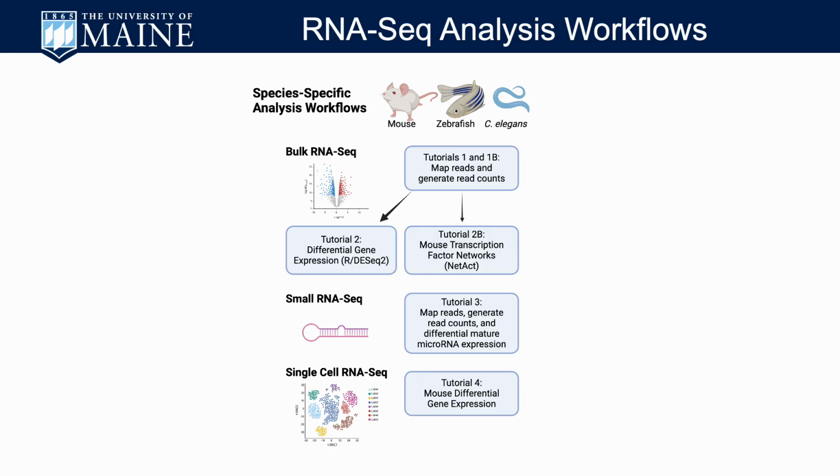The first set of tutorials covers read mapping and generating the read counts. Tutorial 2 reads in those read counts and tests for differentially expressed genes using DESeq2. Another tutorial demonstrates how to use the NetAct package to analyze transcription factor networks using data from the mouse.